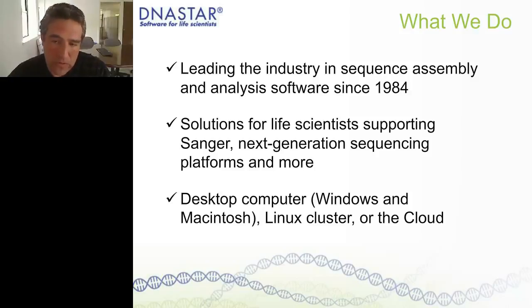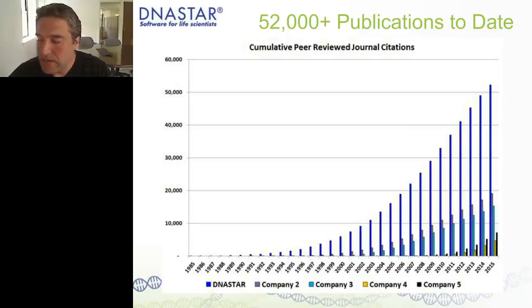And of course, when NGS hit the scene several years ago, there was a great challenge because the amount of data produced sometimes exceeded what a typical desktop computer could handle. What we're going to be doing today is looking at a workflow where we really tackled a large problem, and that's a large de novo assembly of transcriptomes on desktop computers. So it's really quite a feat to handle these large data sets on regular computers.